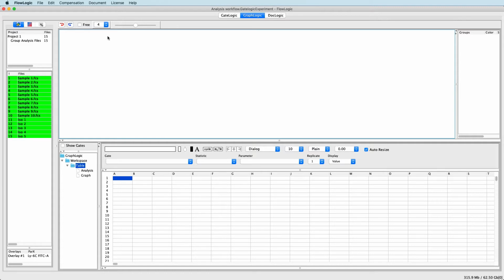And instead of the Advanced Functions drawer, there is the Workspace spreadsheet. And this is where all forms of data can be imported and rearranged. It is worth noting that the gating hierarchy is hidden from the File Inspector, as the population selection is performed in the workspace, as I will demonstrate. So to import our FCS link data, we select our samples in their experimental groups and drag them into the workspace. This generates a graph table with a table name, group names, and sample numbers.